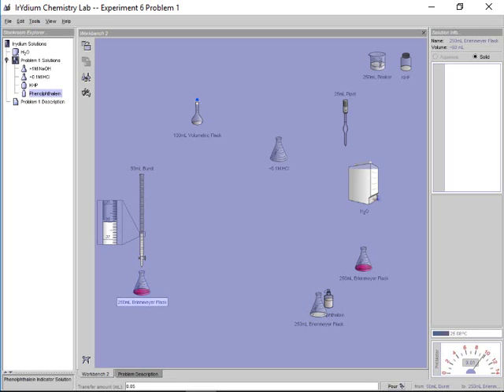This gives me here 36.02, plus or minus 0.05. Let's find that difference in volume. Let's see if it was close or not. Even though this is a virtual environment, it does simulate some random error. So 32.35. It's a little bit less than we had earlier.